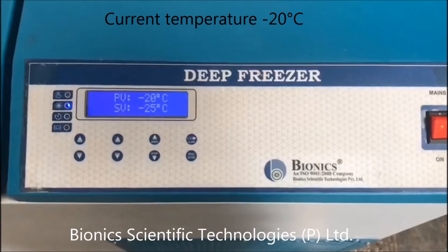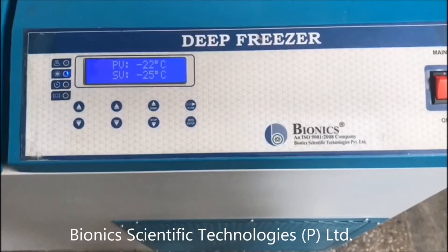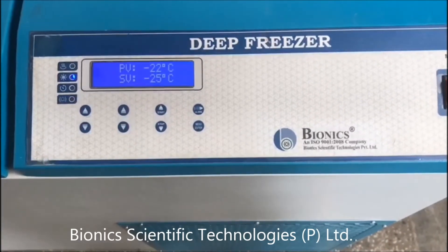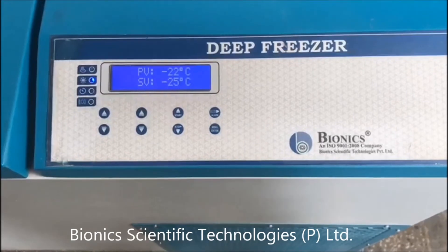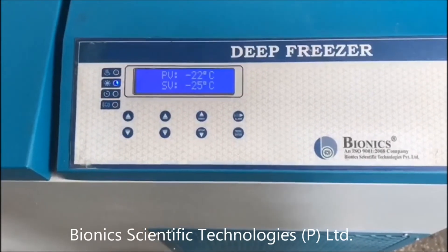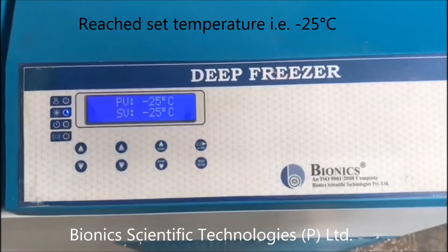As you can see, the temperature we have set is minus 25 degrees Celsius and the present value is now minus 22 degrees Celsius. Whether you set it to minus 25, minus 10, minus 30, or any other temperature, it will take around 20 to 25 minutes to reach the desired temperature. We are now about to reach our target — and we have reached our temperature.